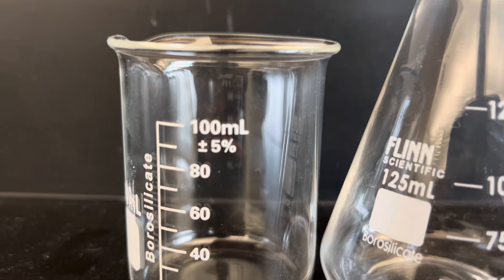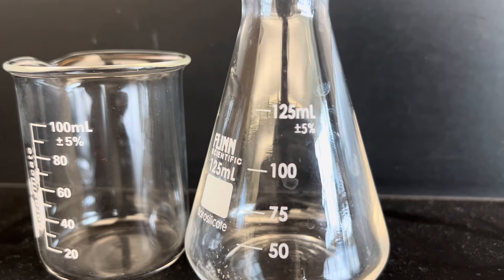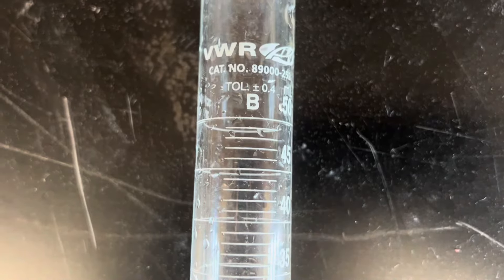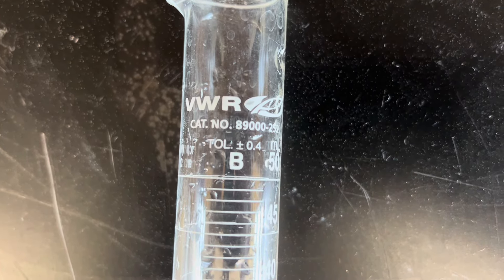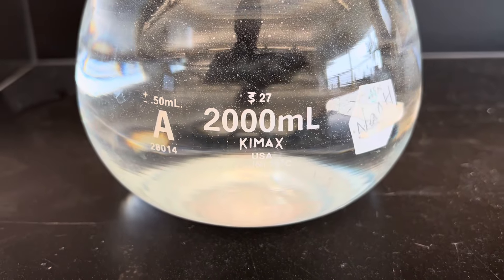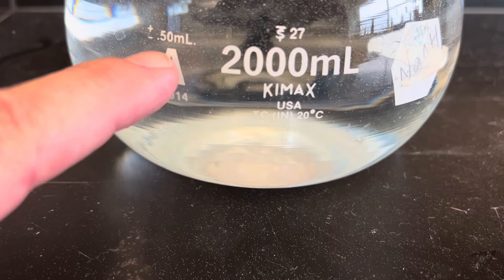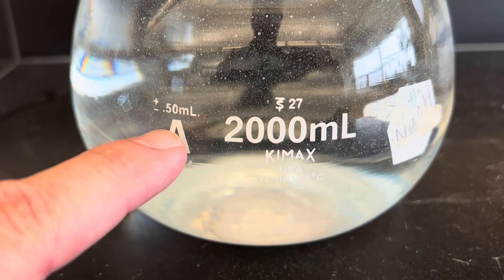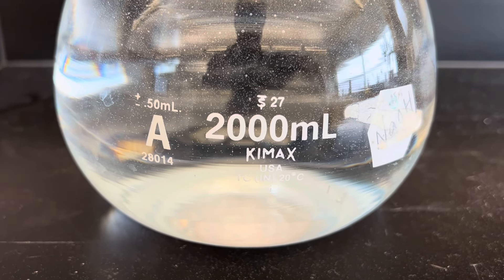A final note: many pieces of glassware have their uncertainty actually printed on them, sometimes labeled as the tolerance. This beaker and this flask, for example, have an accuracy of only plus or minus five percent — and if you want an accurate solution, that's not going to cut it. On the other hand, this graduated cylinder has a tolerance of 0.4 milliliters, so if you measure to the nearest milliliter, you might be off by 0.4 milliliters in either direction. This 2,000 milliliter volumetric flask has a tolerance of 0.5 milliliters — so if I measure out 2,000 milliliters, I know I'm within plus or minus 0.5 milliliters, which is a very small amount of error.